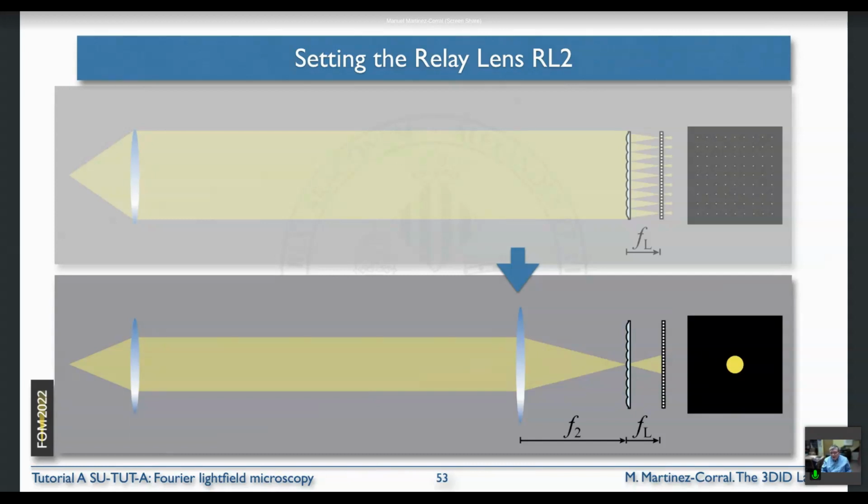Okay, only the central microlens is illuminated. So this is the bad position, good position, and okay.